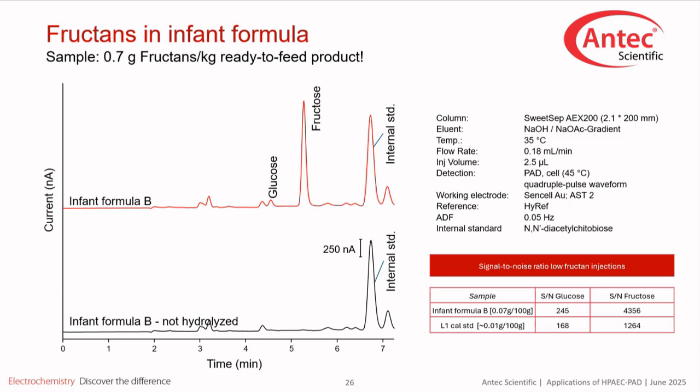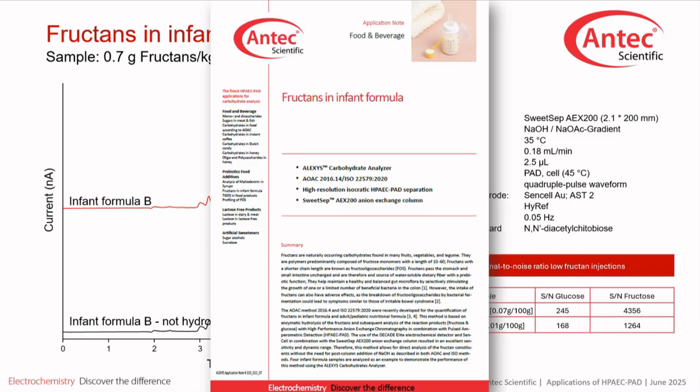in this slide. In the first sample preparation step, all carbohydrates containing fructose and glucose that are not fructans, so sucrose and other alpha-gluco-oligosaccharides, are completely hydrolyzed. Then the remaining oligosaccharides, including the fructans, are separated from the monosaccharides using SPE, solid phase extraction. In the final step, the isolated fructans are hydrolyzed with fructanase into glucose and fructose. The detailed sample preparation steps can be found in the respective application note on our homepage, ready for your download.